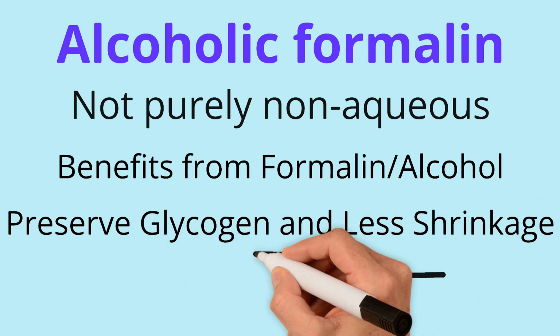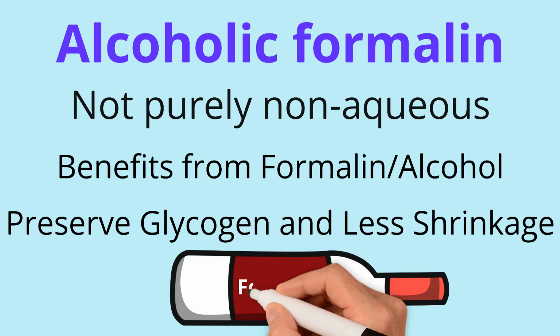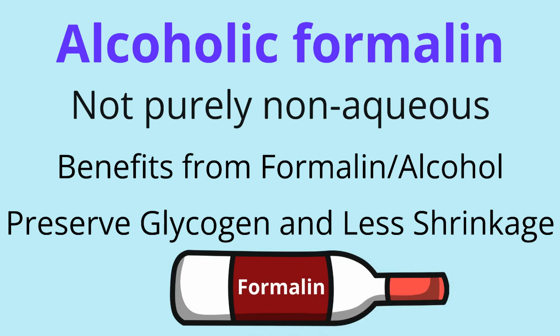Both ethyl and methyl alcohol are toxic if ingested. Methyl is much more dangerous. It can even cause blindness and death.